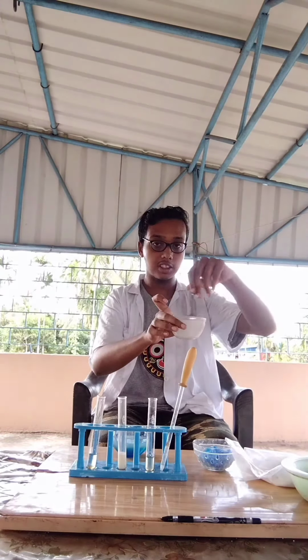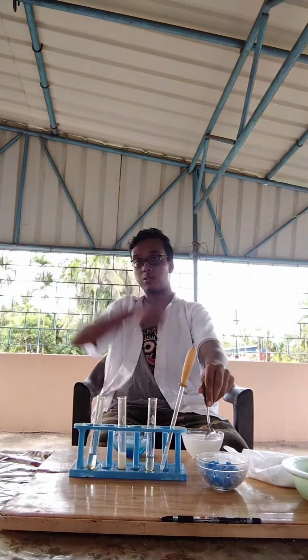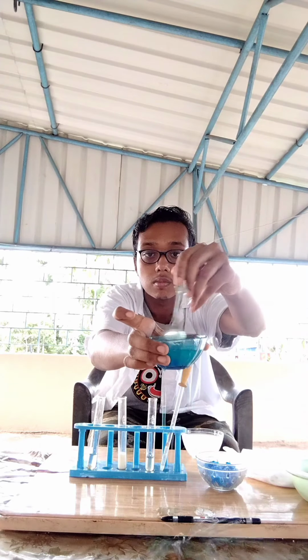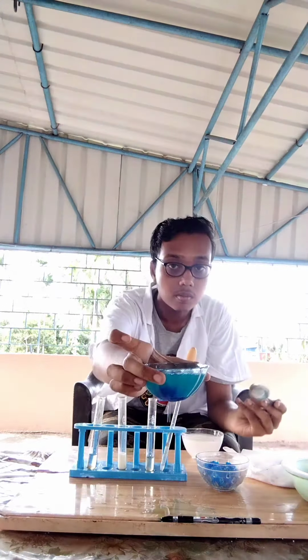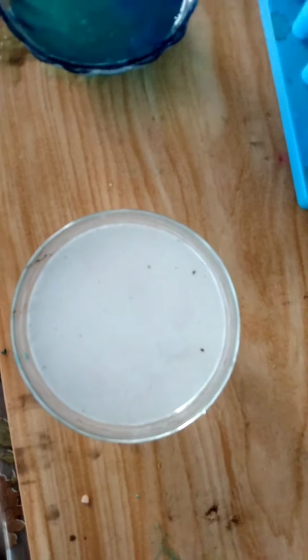Now we will simply be mixing these aqueous solutions. This is our final solution of sodium hydroxide and copper sulphate.